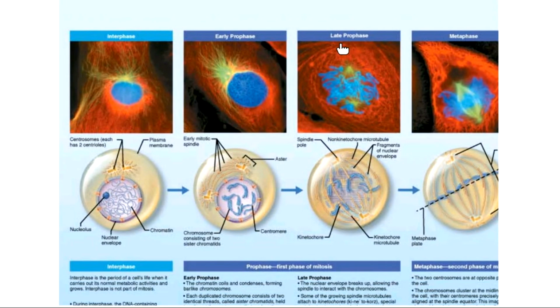If we're talking about early prophase, the beginning of the process of DNA division, that's when we start to see those polka dots in the nucleus of the cell, because those polka dots are the chromosomes condensing down into lines of genetic information instead of just a squiggly mess. So the first way you might see a cell in prophase is if its nucleus looks like a solid nucleus, but there are dots inside of it. That's a cell in prophase. That's a cell getting ready to start dividing its genetic information.